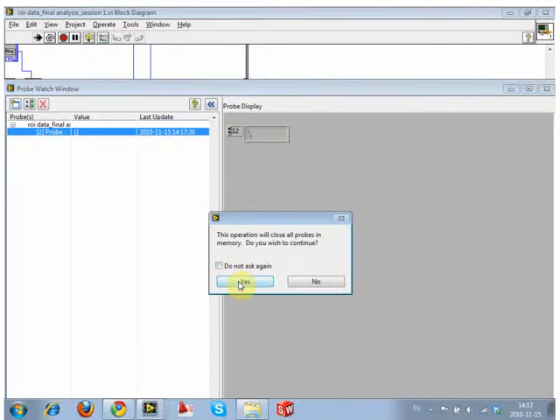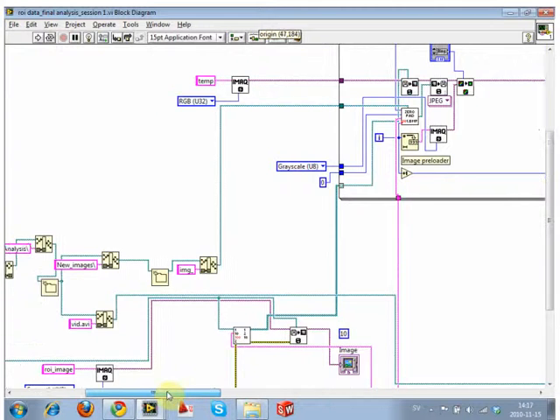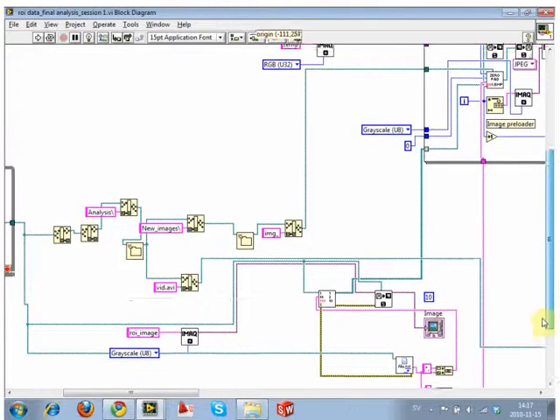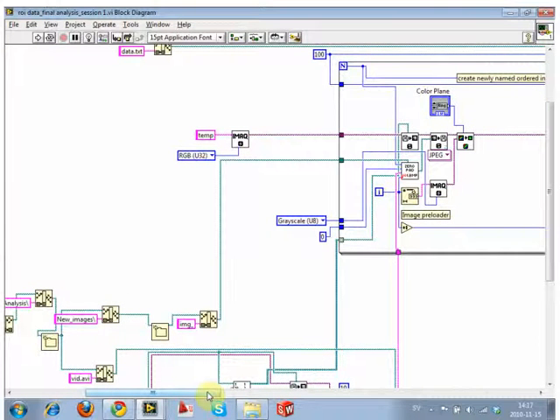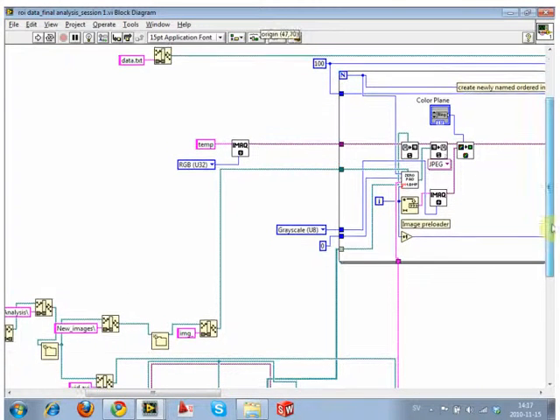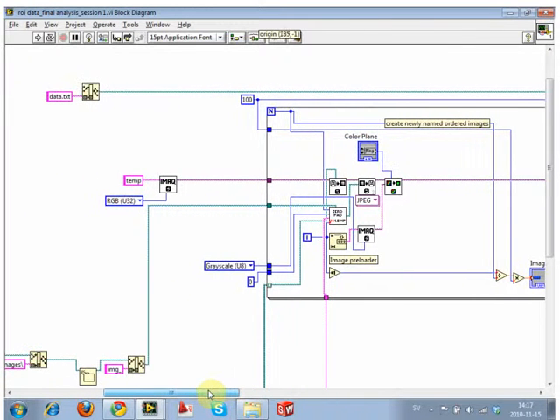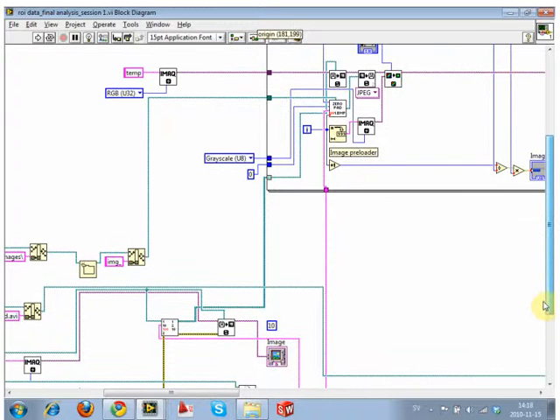Now we're going to try and fix it. So we can switch that off and stop it. Then we have to try and fix the problem, and it can be more or less anywhere. This is awful when you don't have the error. It can kind of be anywhere. So this is where we start probing just about everything and try to find where on earth this error is.